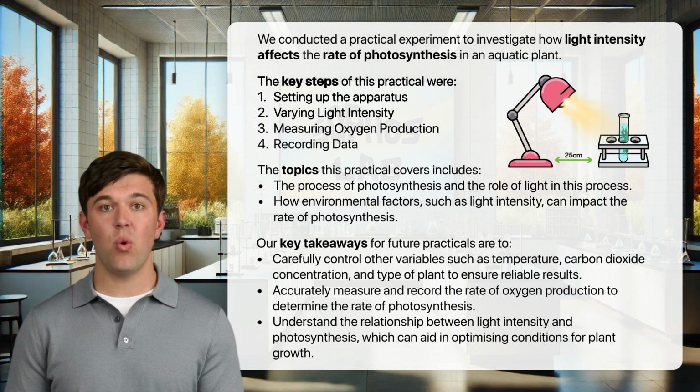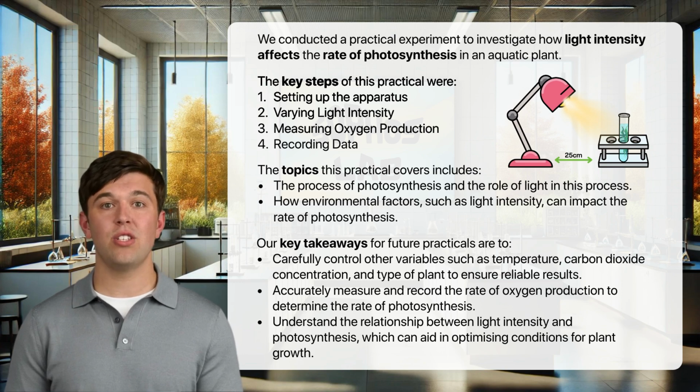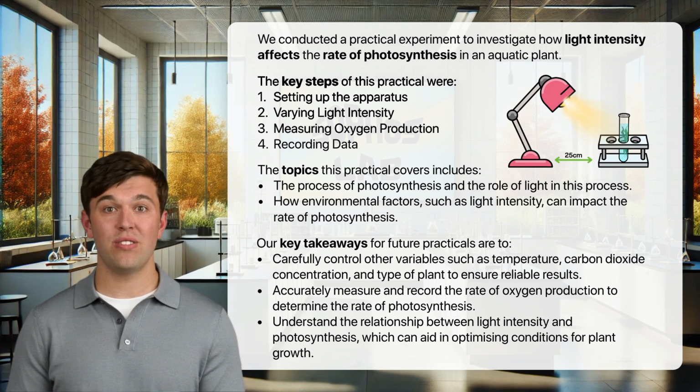Accurately measure and record the rate of oxygen production to determine the rate of photosynthesis. Understand the relationship between light intensity and photosynthesis, which can aid in optimizing conditions for plant growth. This practical not only reinforced our understanding of the photosynthetic process and the critical role of light, but also emphasized the importance of controlled experimental conditions to derive meaningful scientific conclusions.